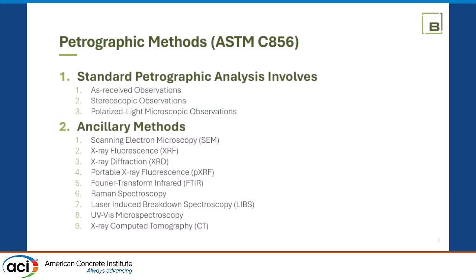The SEM is, you've seen it abundantly, you'll see it over and over again. It's a great technique. Sometimes the speed of analysis isn't sufficient for me to move fast, to rent time, to get a sample in the system, just process times. It can slow me down. And petrographic analysis is a slow process. Also, the nice thing about SEM is you can get that point analysis versus the bulk analysis, which is really helpful. X-ray fluorescence, we just saw one on micro X-ray fluorescence, but mostly on the XRF side.